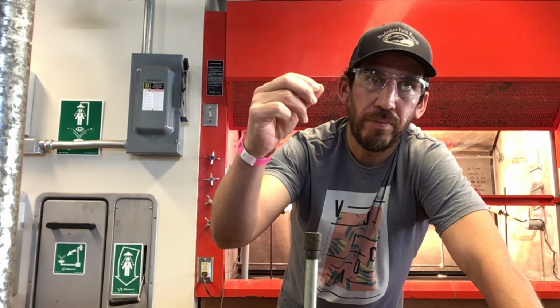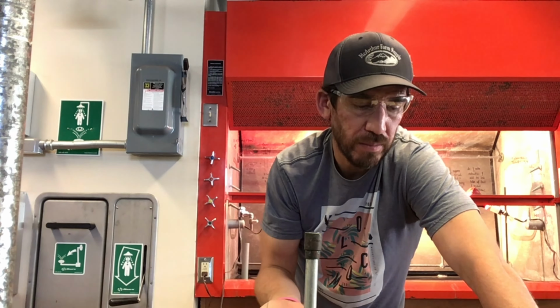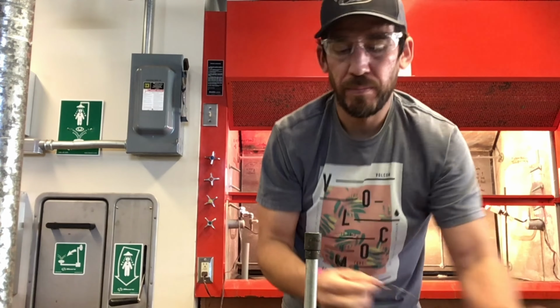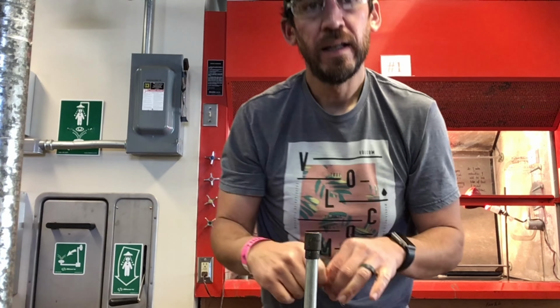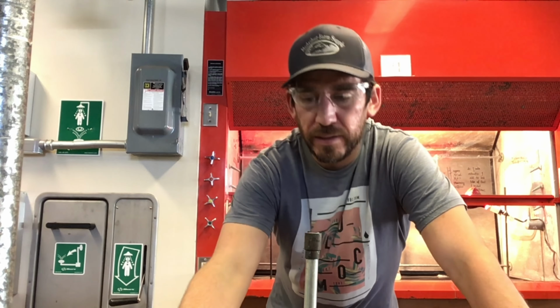This is copper, right? Conducts heat really well. So you might want to make a longer piece than this, maybe even hold it with something else. Maybe make a little loop handle on the end, just so that you don't burn your fingers when you're lighting stuff on fire, because it does conduct heat really well and it gets hot.